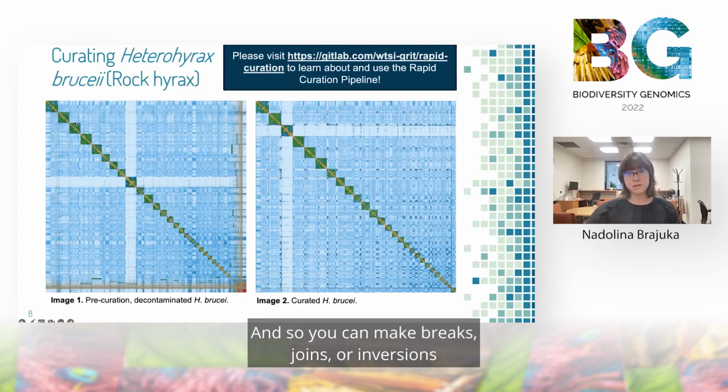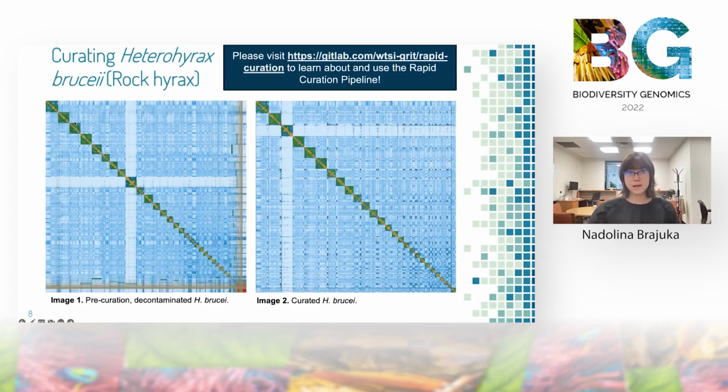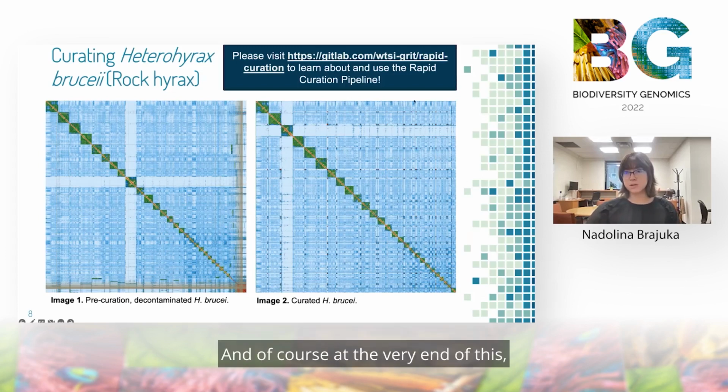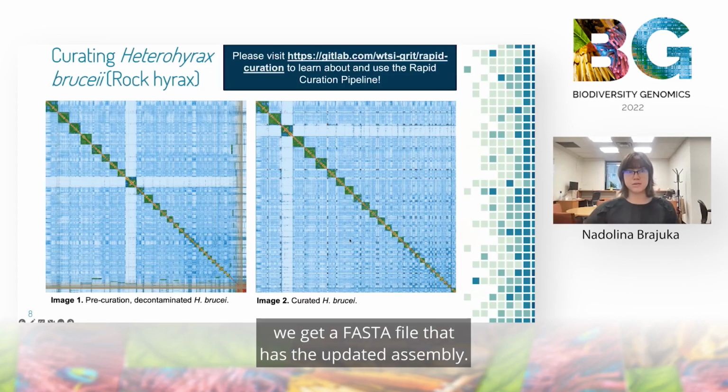You can make breaks, joins, or inversions in this PretextView program. And this is what the final curated H. brucei looks like. And of course, at the very end of this, we get a FASTA file that has the updated assembly.